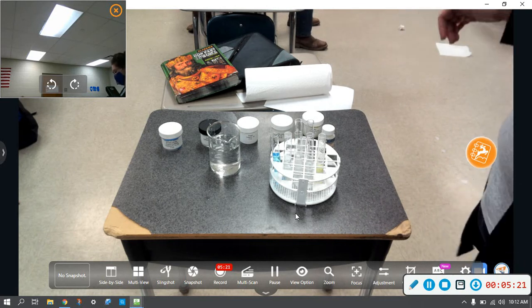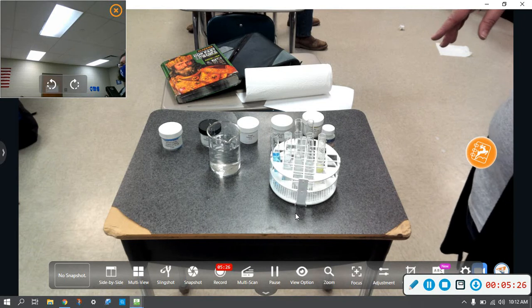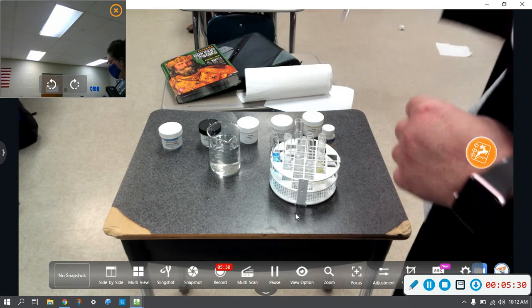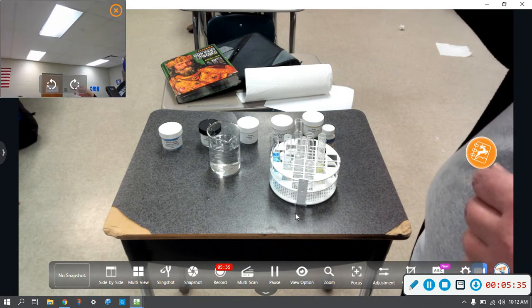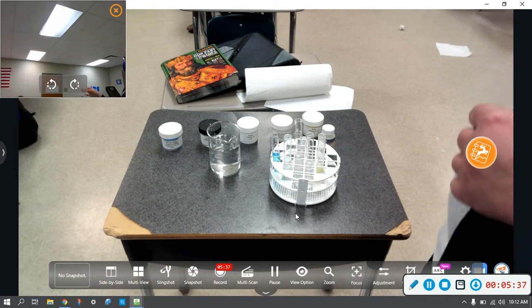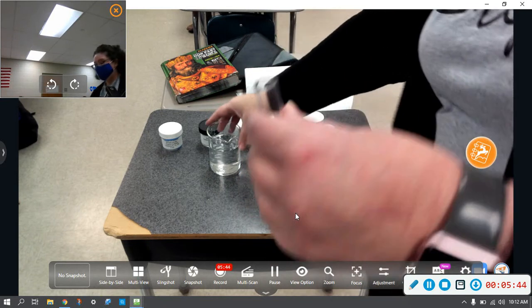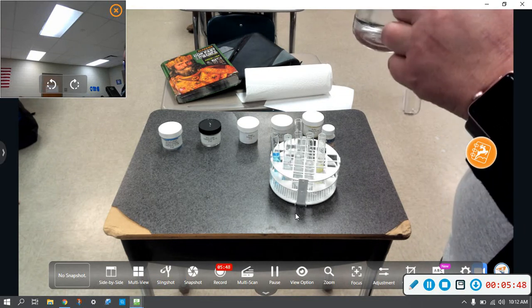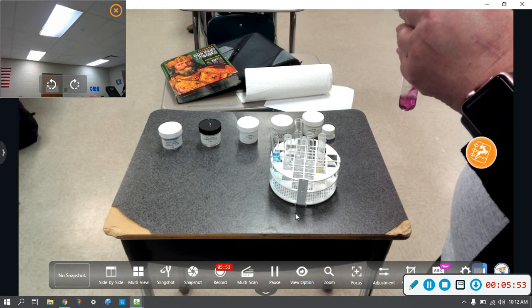All right. Now, down below your chart, there's two questions. The first one, I think, asked you about potassium permanganate, right? Okay. I have a tiny little bit of potassium permanganate in this test tube, and the reason I have a tiny little bit is because it makes a big old mess. So, I'm going to mix water with a little bit of potassium permanganate. What do y'all think will happen?